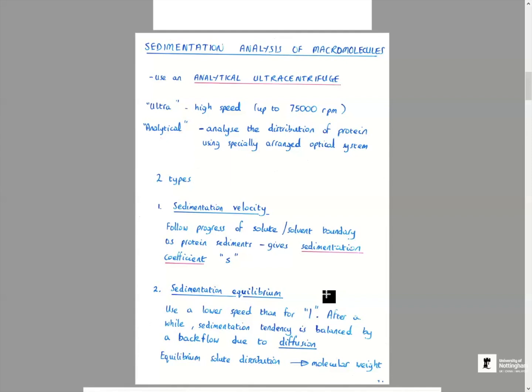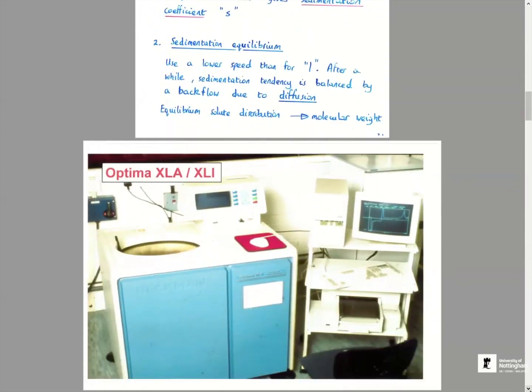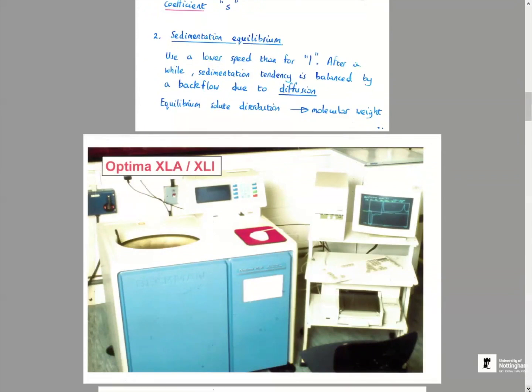Probably no centrifuge left either, if you didn't have a vacuum. So you have to run in a vacuum because of air friction, and that's why we use high vacuum conditions. It's not necessary for low-speed benchtop centrifuges, but for very high speeds it is necessary.